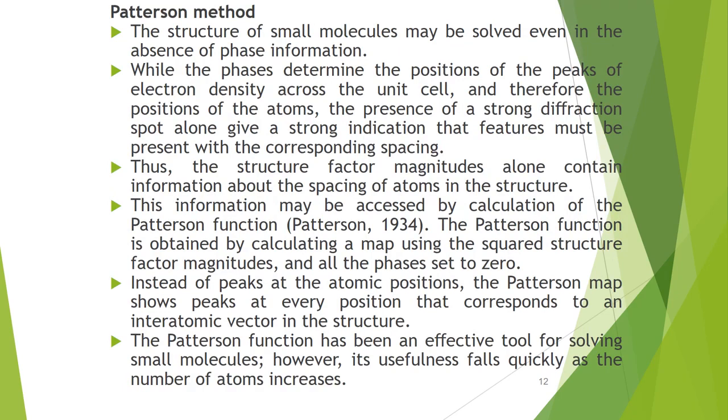There is now the Patterson method. Now we will discuss this Patterson method in this slide. The structure of a small molecule may be solved even in the absence of phase information. While the phases determine the position of the peaks of electron density across the unit cell, and therefore the position of the atoms, the presence of strong diffraction spots alone gives a strong indication that features must be present with the corresponding spacing.